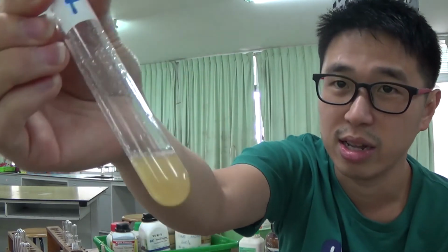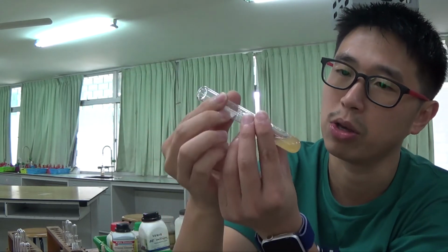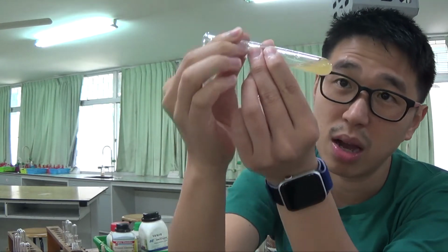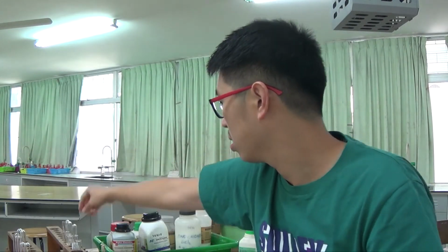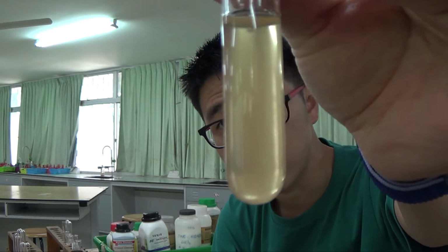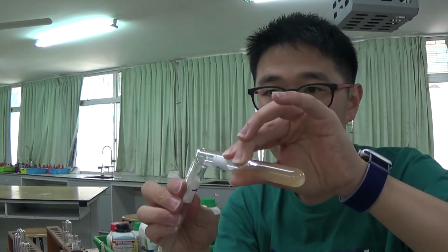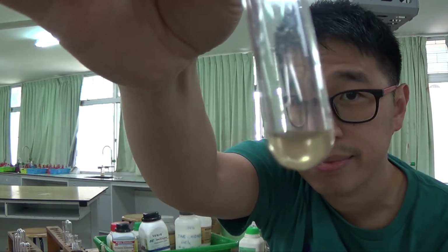Okay, this is very clearly a colored compound. By the way, it's a mixture of two different salts. I want to try and dissolve it as much as I can before I test for it. So I'll put it into two different portions. I just want the solution, I don't want the solid. You see, there are some solids settling at the bottom. So if you just let it settle for a bit, which in exams they will just give you a solution like this.